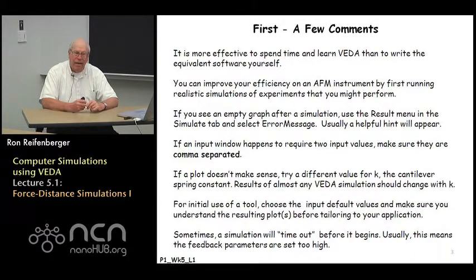Sometimes you'll get a plot and it doesn't make sense to you. What do you do? My advice is to change the value of the spring constant of the cantilever. Most of the simulations that we're going to perform depend on the spring constant in a very direct way. And so by changing the spring constant, you should be able to make some headway into sorting out what the plots actually are trying to tell you.